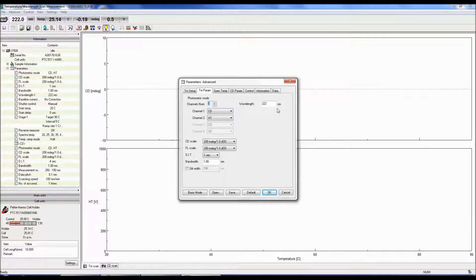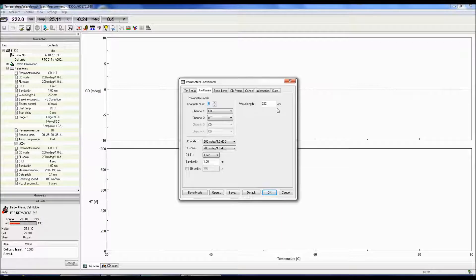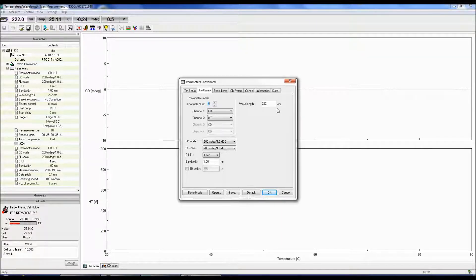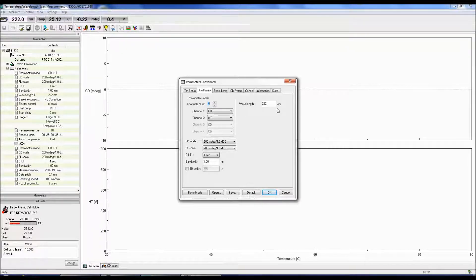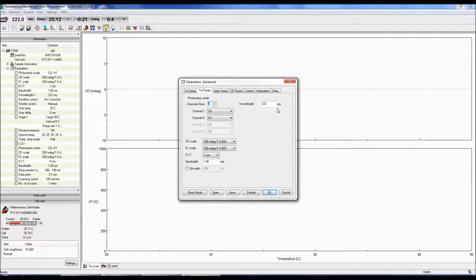In the Wavelength text box, enter the wavelength to monitor the CD signal at. If you're not sure what wavelength to monitor, first take a spectral scan of your sample. Choose the wavelength of the most prominent peak in the spectral scan to monitor the thermal stability of the sample.